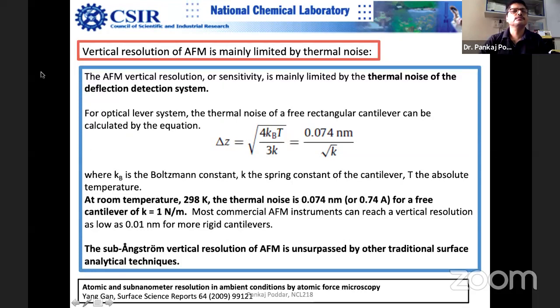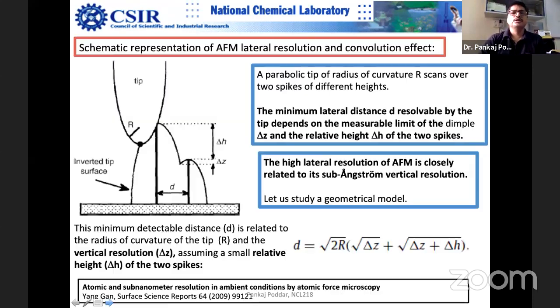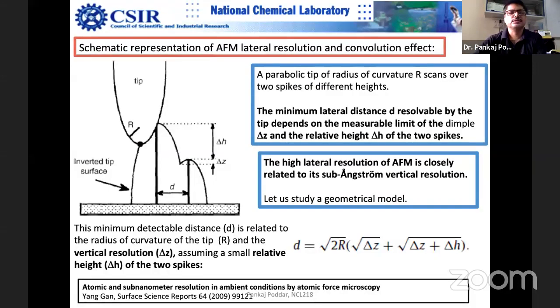Okay, so let's go to the next. So, lateral resolution of AFM. Now we have the vertical resolution, so we can calculate the lateral resolution, because lateral resolution is determined by vertical resolution also. Let us look at how they are connected. So this is our tip.